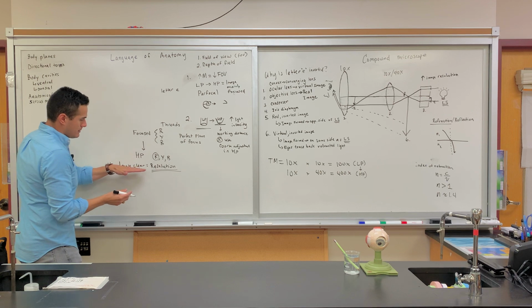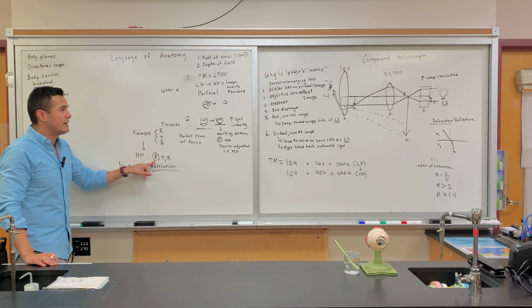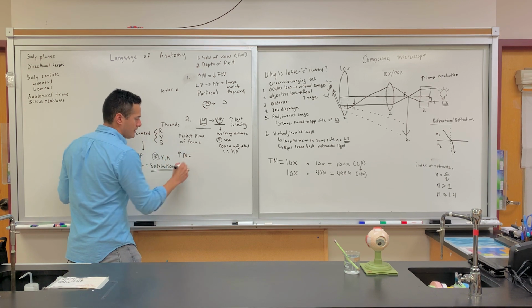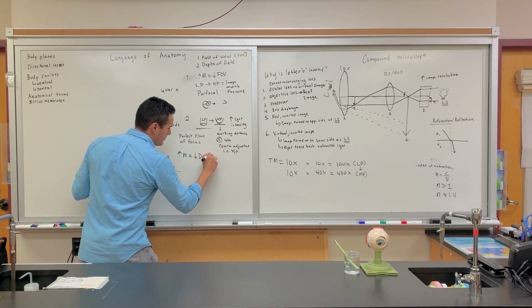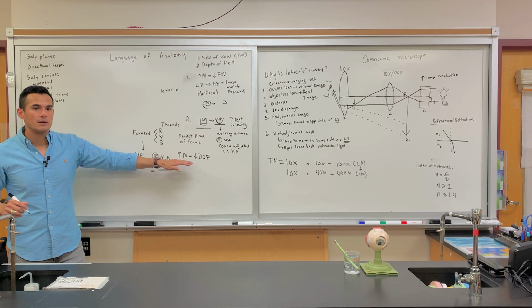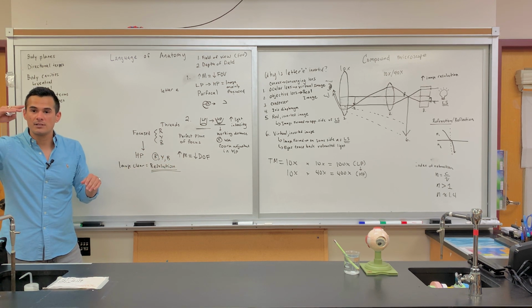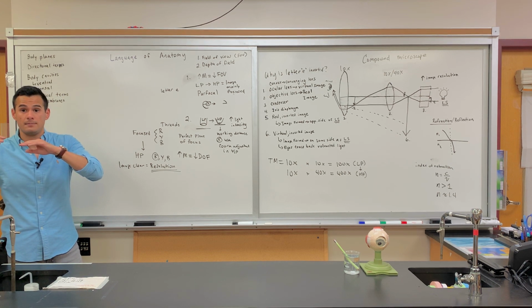The image is clear, but you can only focus on one of them at a time. And it's a similar relationship: as you increase the magnification, there's a decrease in the depth of field. And so what this microscope allows us to do is focus on one particular thing at a time and determine the order that they're in.